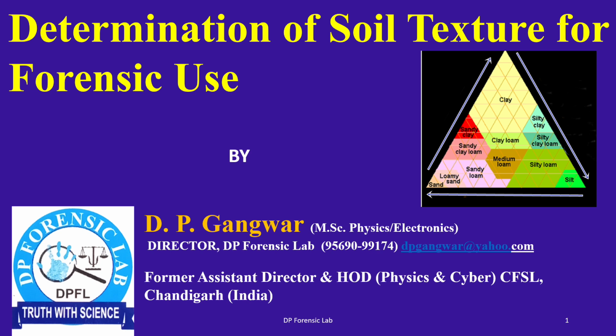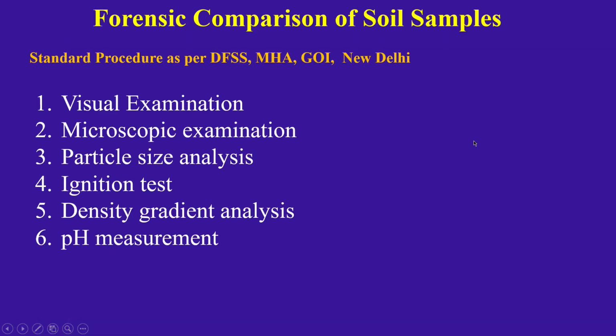In today's video, I will discuss the determination of soil texture for forensic purposes using this soil texture triangle. There are various methods used for comparison of soil samples.